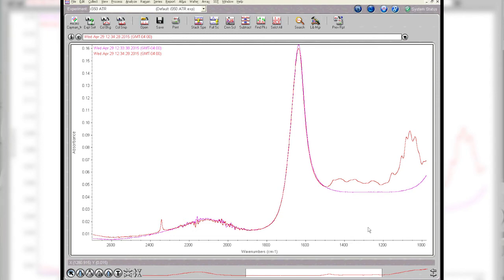Those peaks to the right there, at the low frequency, those are sugar peaks. That's from the sugar that's in the soda. And this sharp little peak right here is due to the dissolved carbon dioxide, the carbonic acid or CO2 that's in there, H2CO3, that's in the solution. So you get this small little peak here.